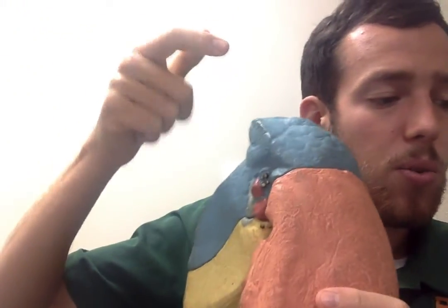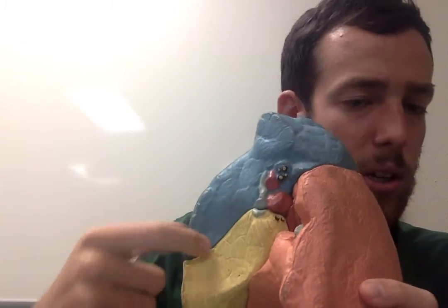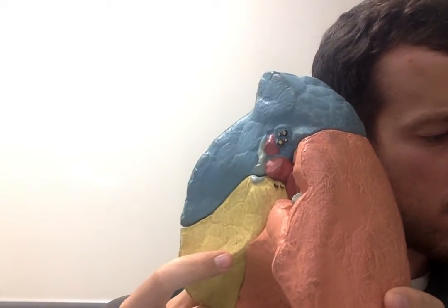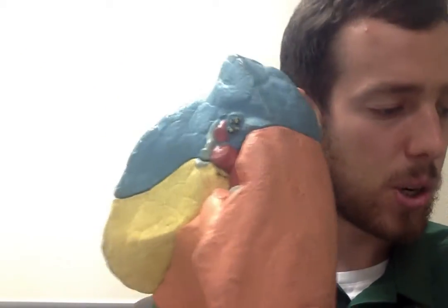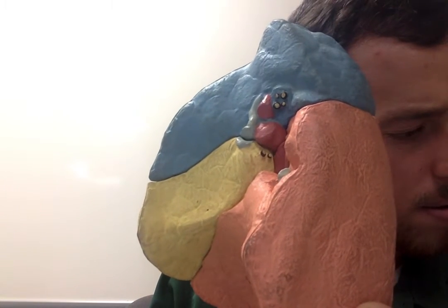Splitting the right superior lobe from the right middle lobe, you have the horizontal fissure. It's this gap. You can open it up a little bit, but it's that gap between the two. And then between the right middle lobe and the right inferior lobe, you have another gap, another canyon. That is the right oblique fissure. I think that's it for our right. So we had 3 lobes on the right.